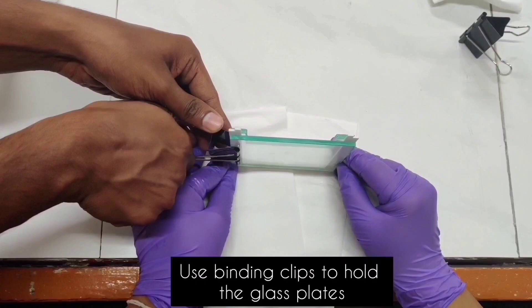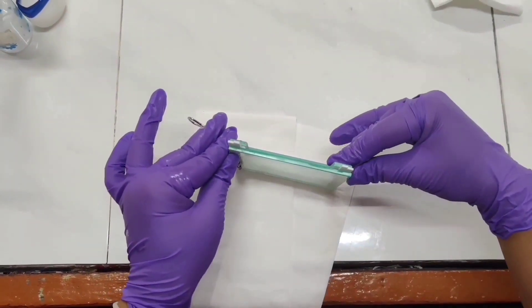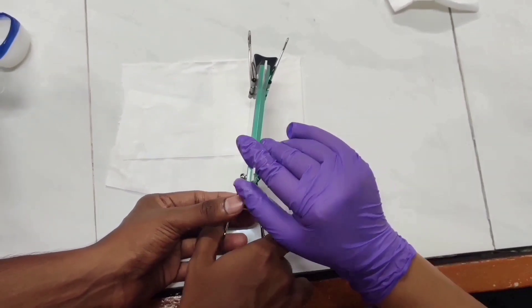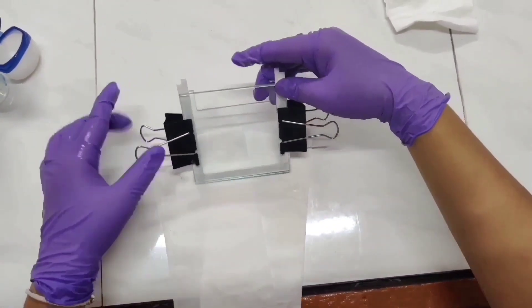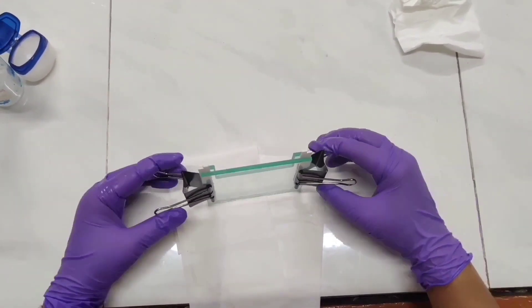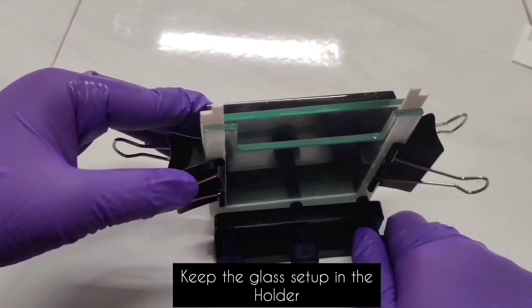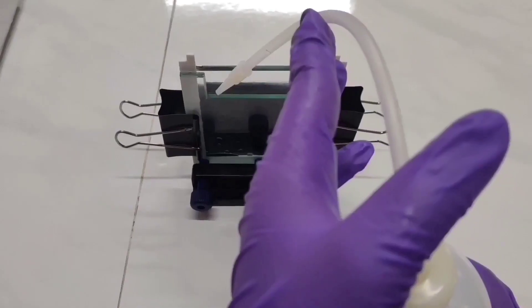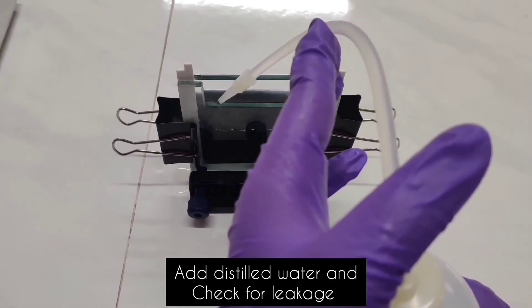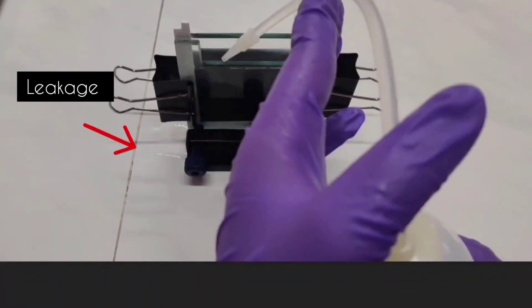The binding clip is placed exactly on the spacers. Make sure not to place the binding clips across the spacers as it might lead to breakage. Once the clips are placed on the notch and glass plates, keep the setup on the holder and tighten it — make sure it is not too strong or too loose. Once we are done placing the glass plates on the holder, we check for leakage. Water is added to the setup to check for leakage.